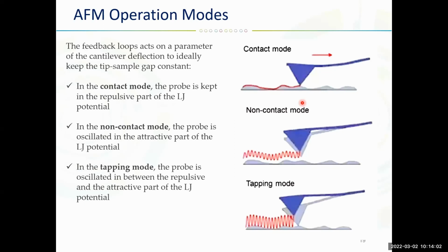Okay, so what are the advantages? The advantages are a high scan speed. This is one of the few AFM techniques that can give us atomic resolution images, and some rough samples with very, very big changes in the vertical topography are sometimes easier to scan using contact mode. Again, the disadvantages are lateral forces, and the combination of the lateral forces and high normal forces can result in reduced resolution due to damage of the tip or the sample.